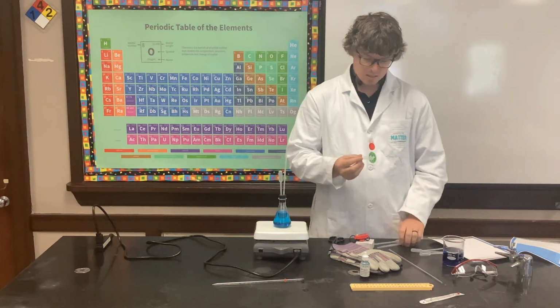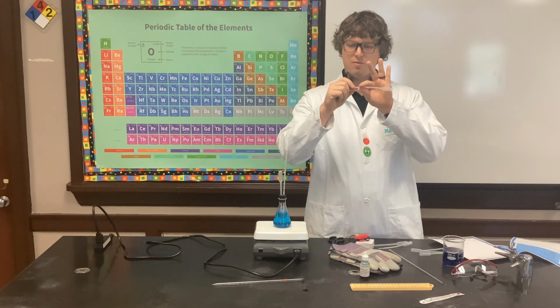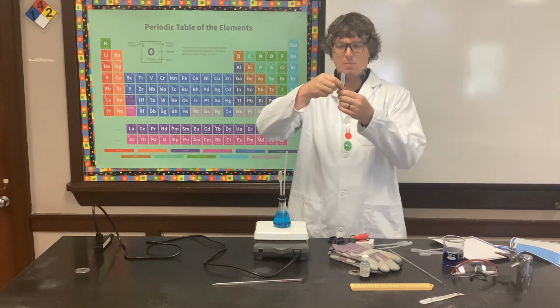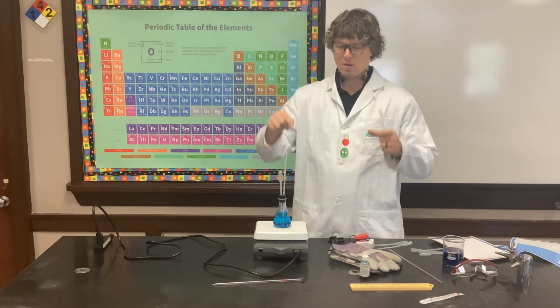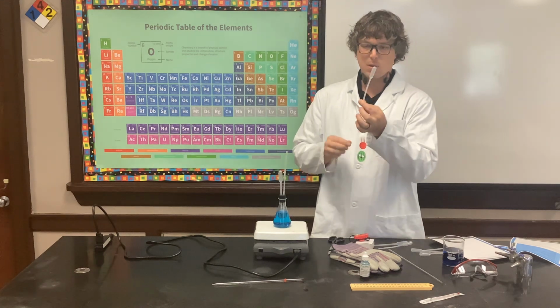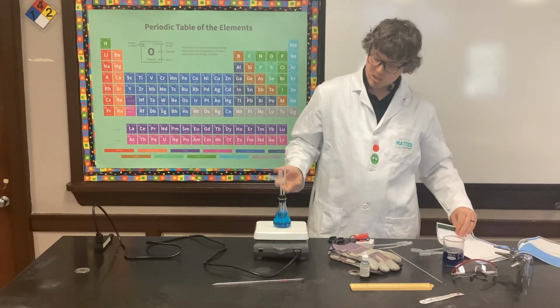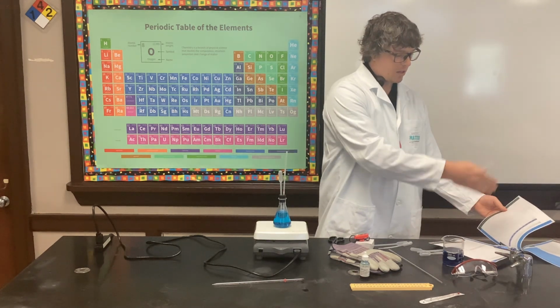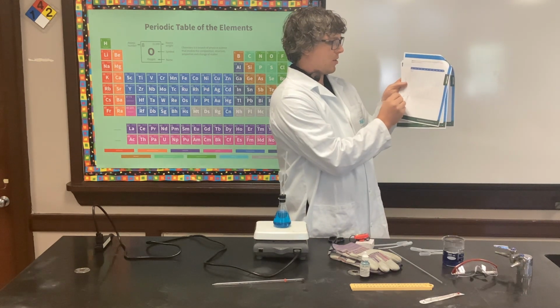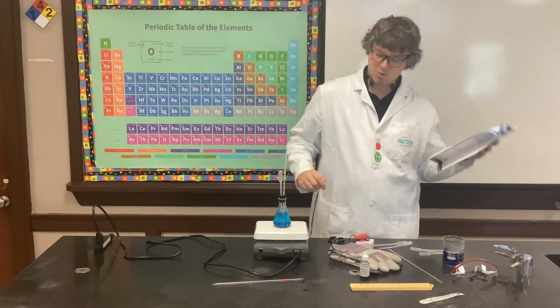All I did was snip off the end piece, the bulb, and I took off one little bit of the front end. I left a little bit because it makes it easier to connect them. I connected a bunch of them together to give me a longer tube, and they squeeze together so it's airtight. What's nice about these pipettes is they have little marks on them already. So when students see the water level rise, they have a clear indication on their chart. I believe they're going to indicate and draw how high it's gone, so those markers will be easy for them to see that progression.